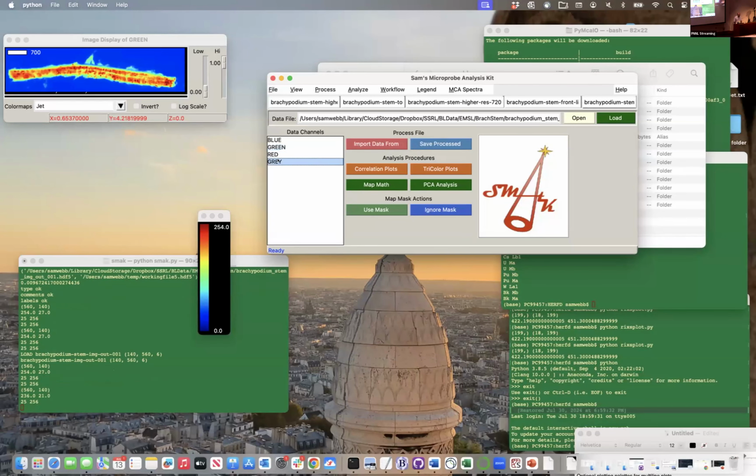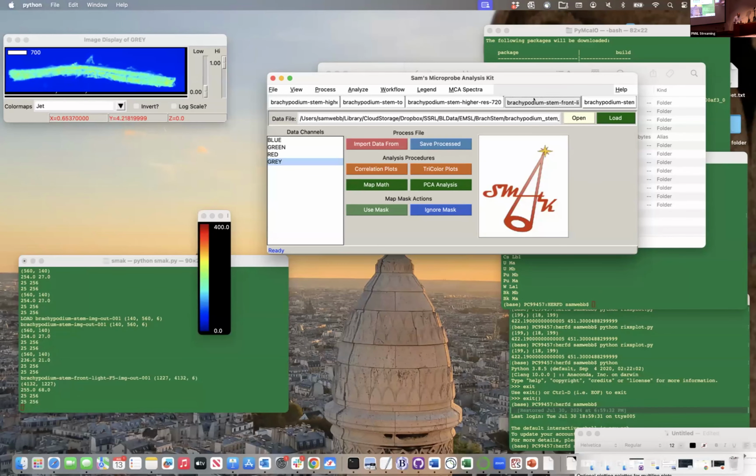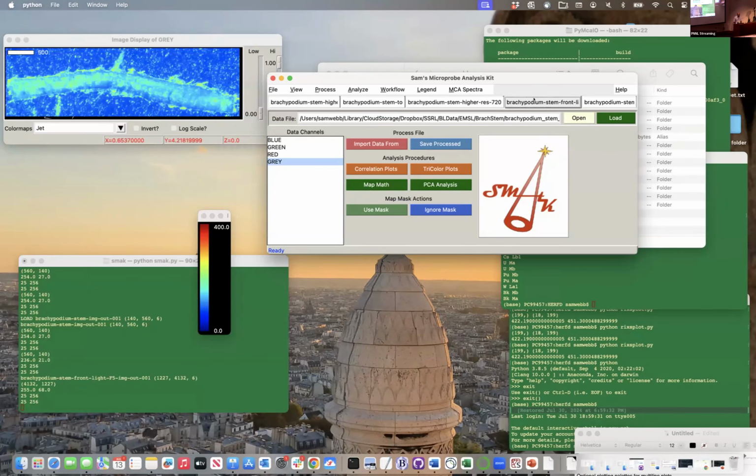And so what I'm going to do is put these images in their respective data sets. So this is the 7.2 image, and this is the 14.3 image. This is where we see that right now, at this exact day, we have different resolution cameras on the 2 different beamlines: an old crappy CCD camera and a really fancy new high-res camera. So that's why this part of this data looks really awesome and the other one looks not so awesome.